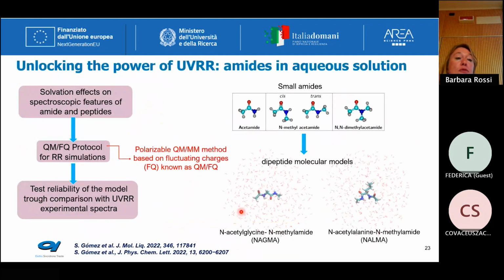In particular, in the case of smaller molecules, for example peptides or short polypeptides, we can associate the experiment also with a DFT protocol for simulation. In particular, we had a collaboration with a group of theoretical chemists in Scuola Normale of Pisa.